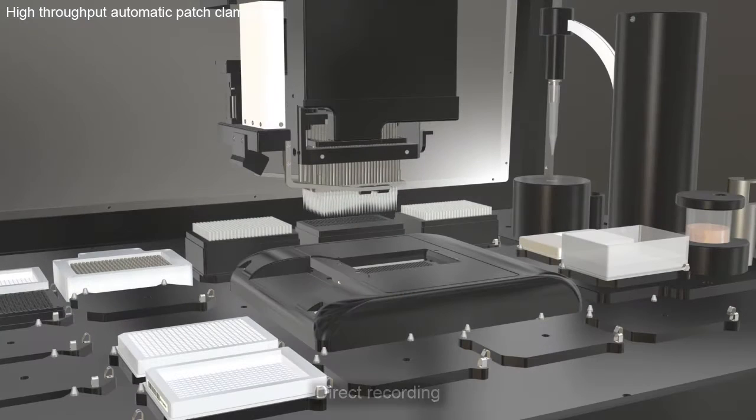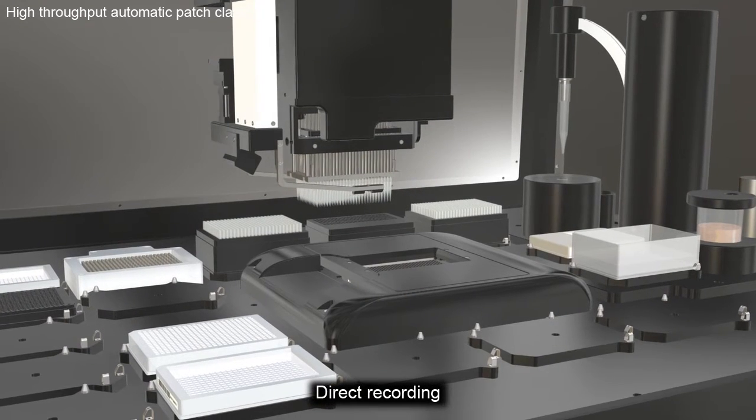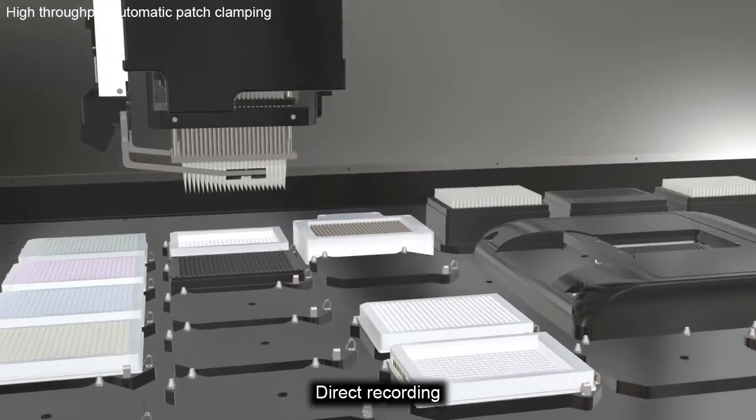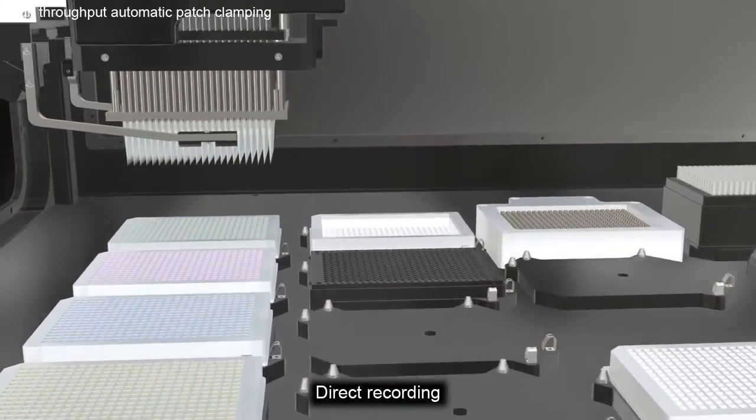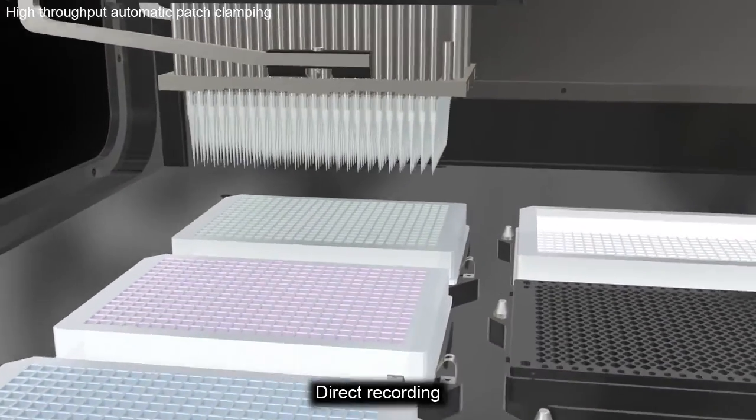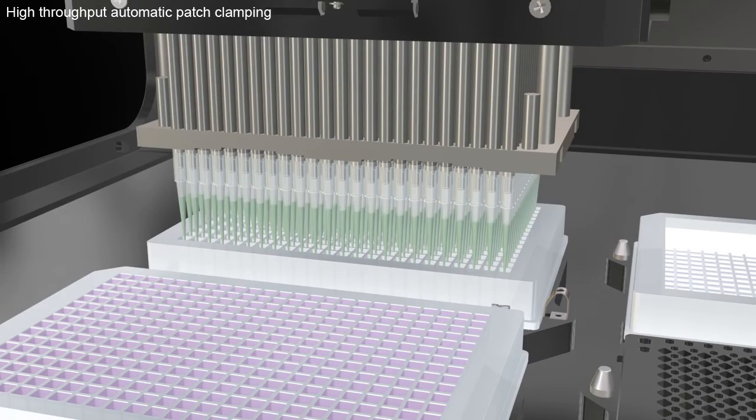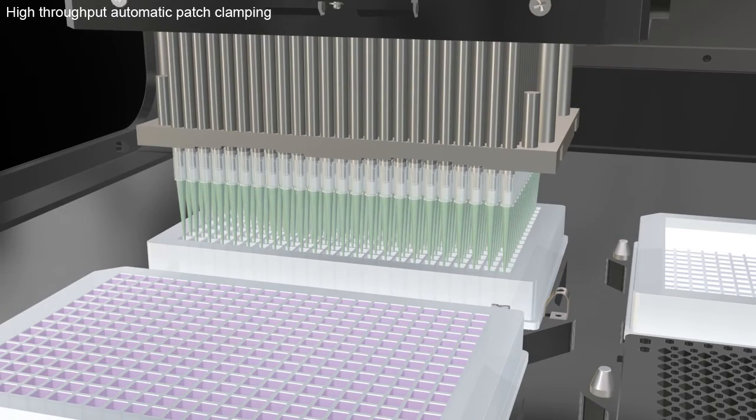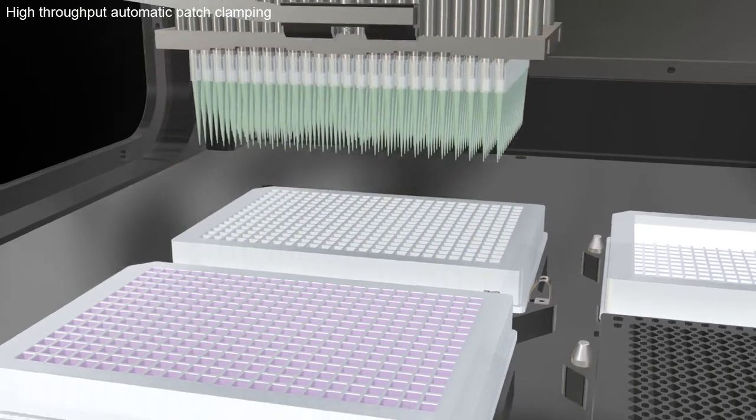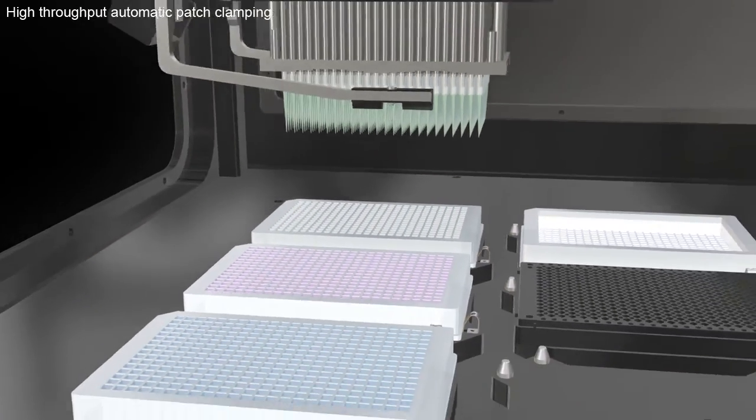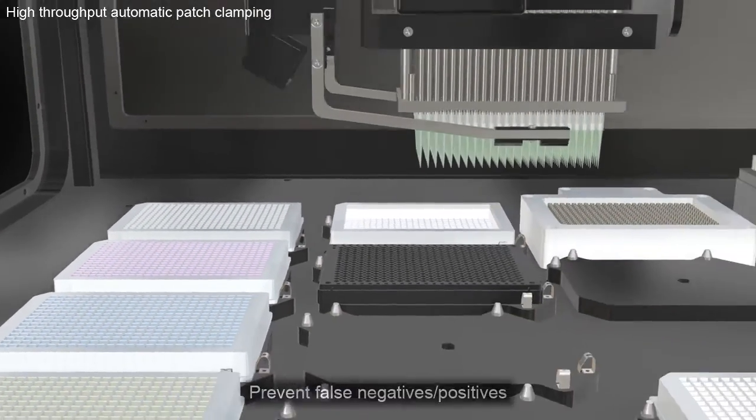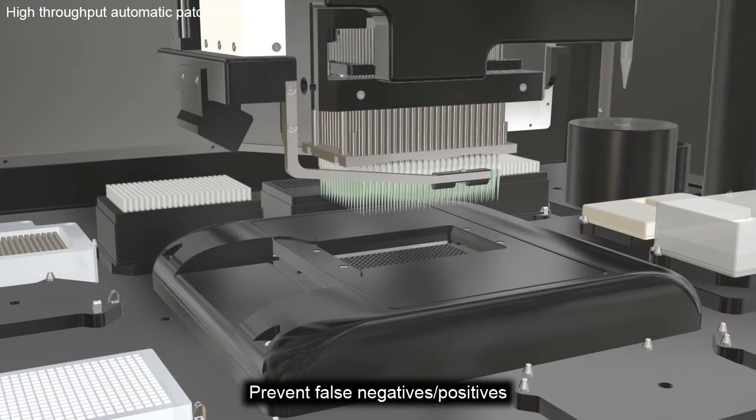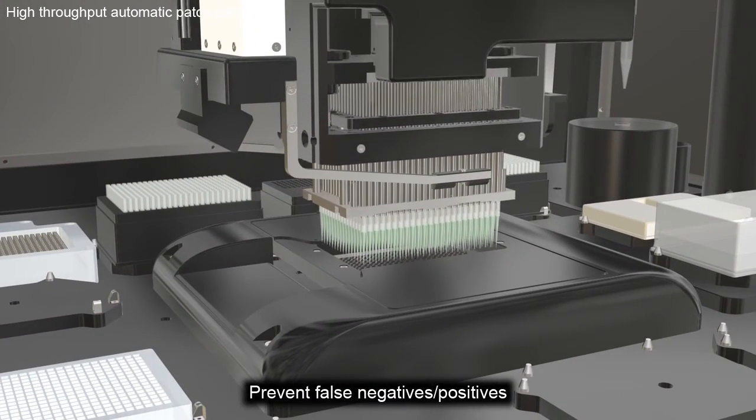Q-Chip performs direct recordings of voltage or ligand-gated ion channels to provide direct measurement of ion channel kinetics and pharmacology. These are critical aspects in ion channel physiology and prevent the generation of false negatives as well as false positives.